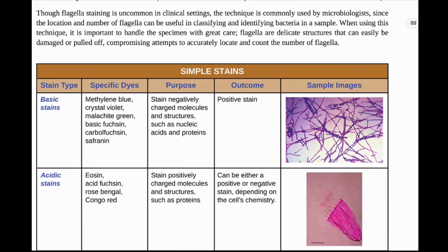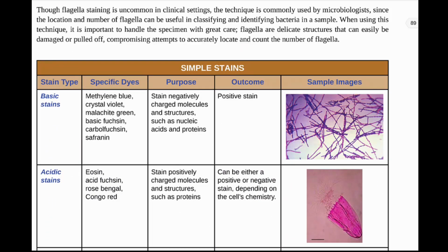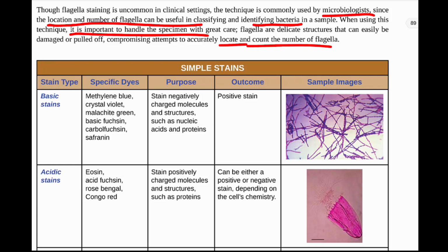Though flagella staining is uncommon in clinical settings, where they most times are not concerned with whether or not there's a flagella, the technique is used by microbiologists since the location and the number of flagella can be useful in classifying and identifying bacteria. So it's used most often in a laboratory. When using this technique, it's important to handle the specimen with great care because flagella are delicate and can be easily damaged or pulled off, and then you won't be able to see, locate, or count the number of flagella. So that's a little bit of a fragile one.